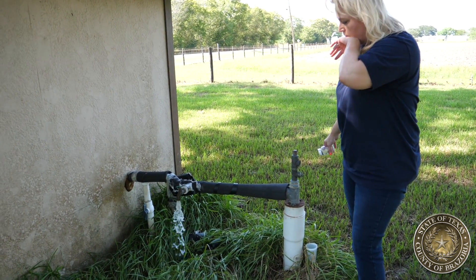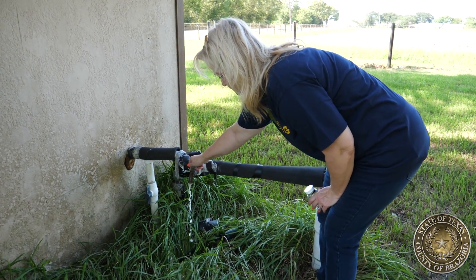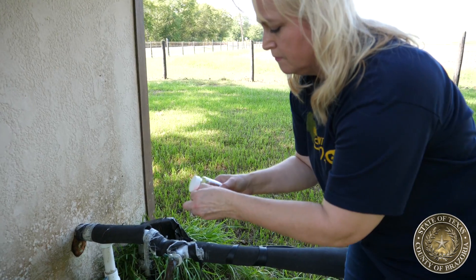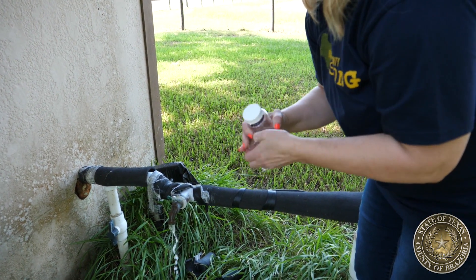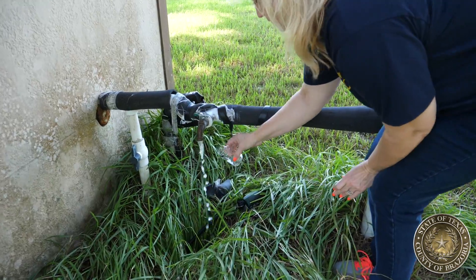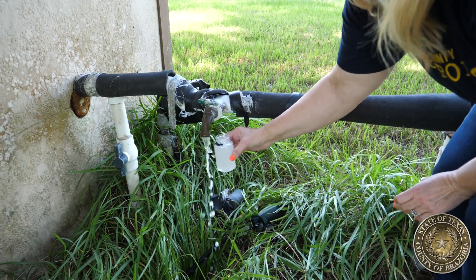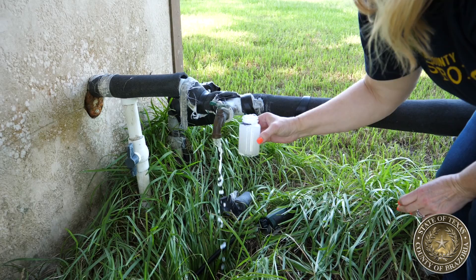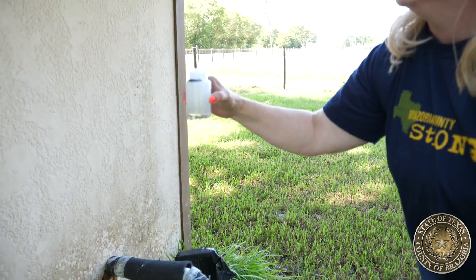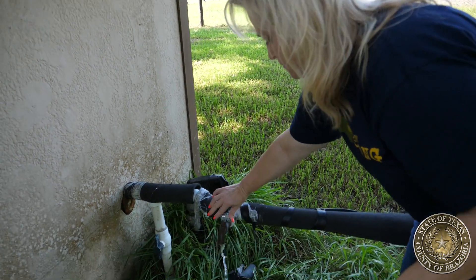After the water has run for three minutes, slow the flow down to a trickle and fill the sample bottle up to the neck. You'll need to remove the plastic ring that's on top of the cap, then remove the cap but don't let it touch any other surface — do not set it down. Fill the bottle all the way up to the mark. Do not rinse the container; the white substance inside is perfectly normal. Do not touch the inside of the bottle or the lid. Collect the sample and replace the lid as quickly as possible, as airborne particles may contaminate your sample.